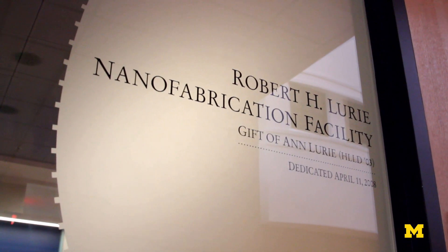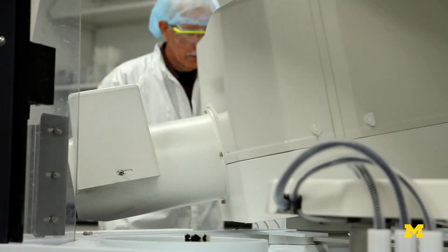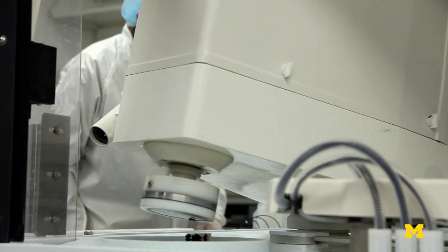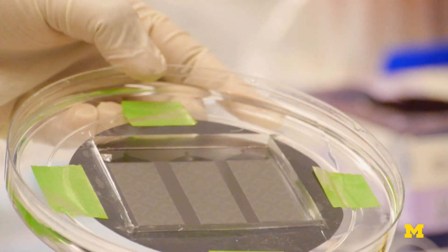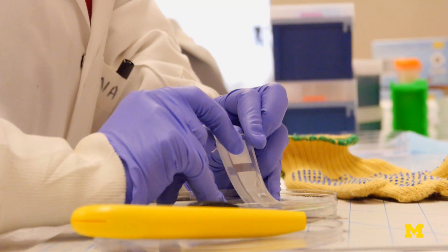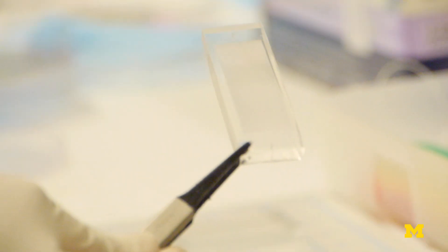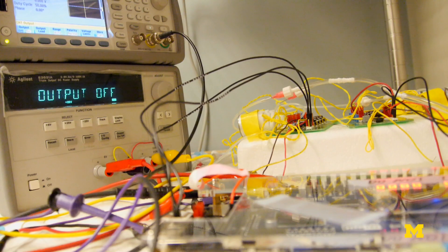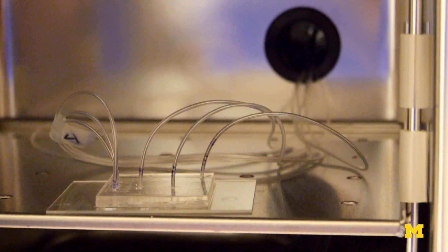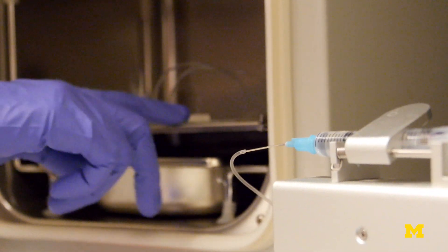We make these molds in the Lurie Nanofabrication Facility, North Campus, Engineering Campus. This is the mold which is made in the clean room, and then we pour the polymer here, baked inside an oven, take it out, cut the devices, and then bond them to a glass slide. This comes out really cheap that way, and we can easily make design changes, patient-specific, so that you can tailor-make your technology rather than just making a toy and leaving it in the lab.